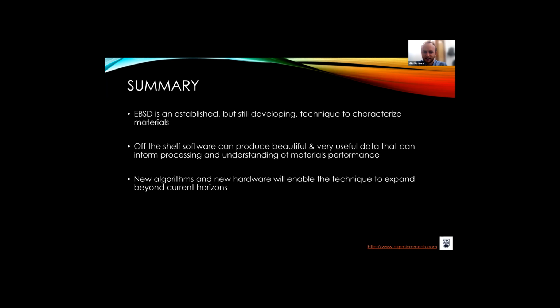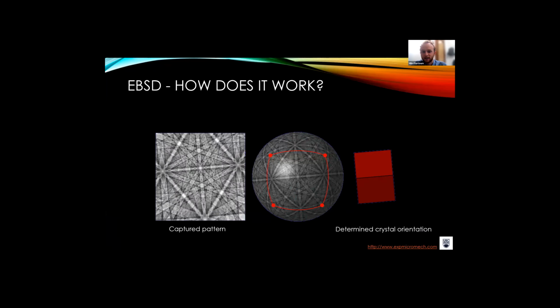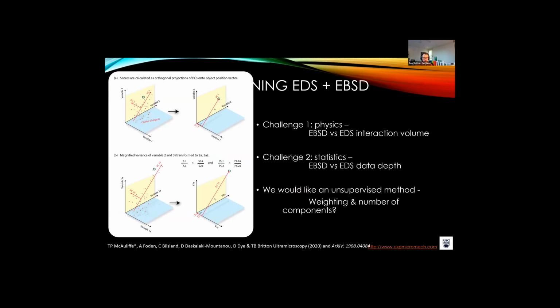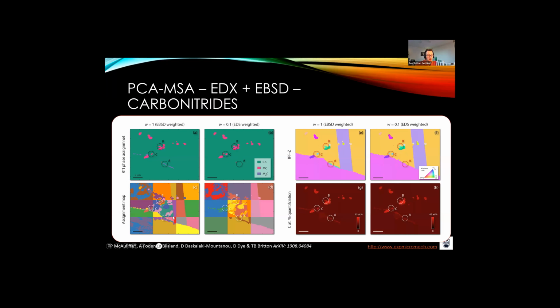Yeah. The next question is, in the Warhol-like segmentation with weighted data, is it just for visualization here, or is the data evaluated across the borders of the segments? So the Warhol-like piece here, this is what was being referred to. The visualization here is just that the blue classifier is viewed as different to the orange classifier, even though it is actually probably the same pattern. We just have an independent analysis across each of these frames, and it was simply a RAM issue. To do the PCA, you have to pull the whole data set into your RAM, and I have some big computers, but this was a bit annoying.